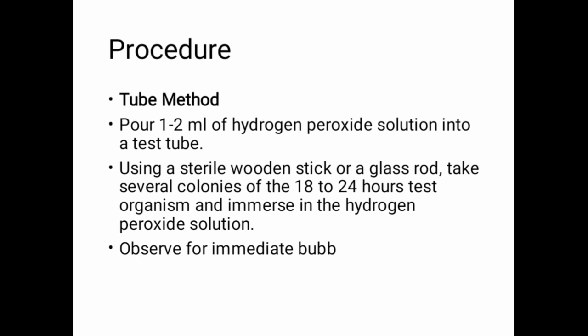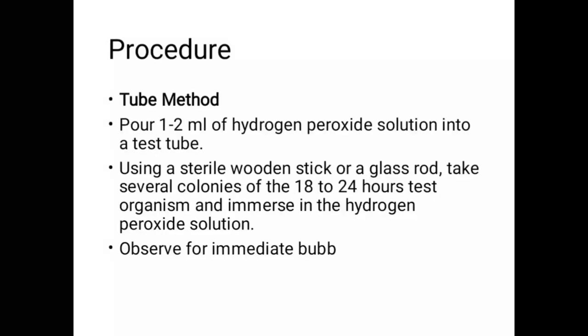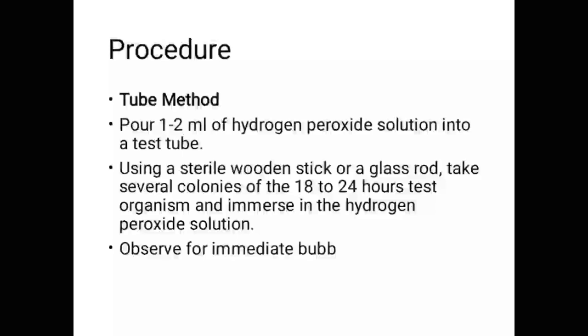We must know the colonies that we pick up should be from a 24-hour organism. If the colonies we take are from more than 24 hours, the result will be falsely negative because the enzyme catalase is not stable for a prolonged time.